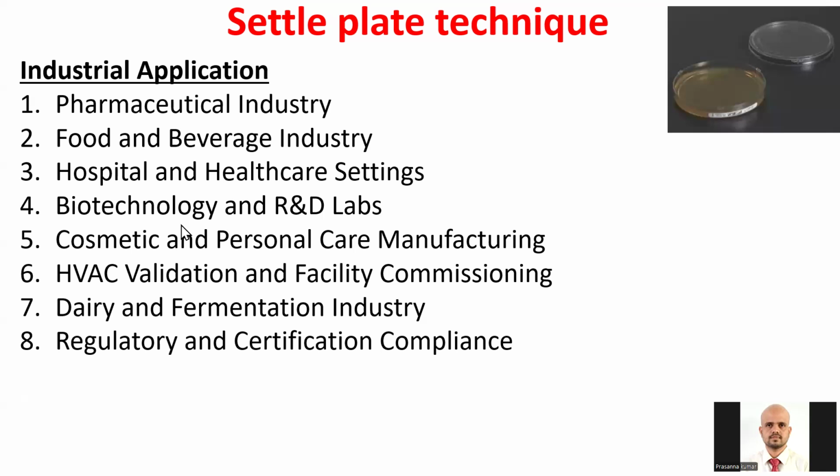In dairy and fermentation, milk processing, cheese aging, and fermentation tanks should all be regularly monitored. Even for regulatory and certification compliance, for example ISO 14698, routine environmental monitoring is important. If you're applying for that, better have 3 years of data ready before applying.